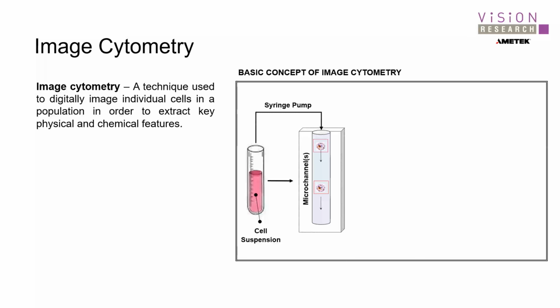They're going to be syringe pumped into a microfluidic device. These microfluidic devices have one or more microchannels in them. These cells will traverse that microchannel, and then there will be some optics, excitation, and sensors to capture images of this event as they travel through this microchannel.